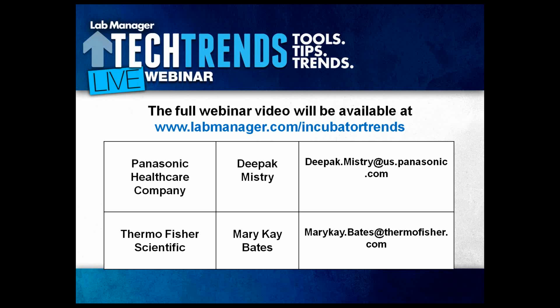Thermo Scientific actually put UV lights in our incubators a long time ago, and we stopped offering that because customers felt like it wasn't really doing anything. At first blush we all think UV is great because everybody uses it in their biosafety cabinet. But it's a different situation inside the CO2 incubator, especially if you're trying to decontaminate either the water or the air. In the biosafety cabinet, you're decontaminating an immovable surface. It's just sitting there and the light is shining on it.